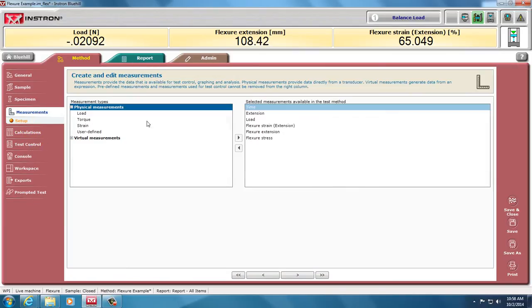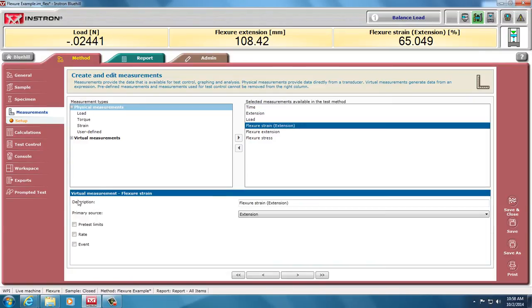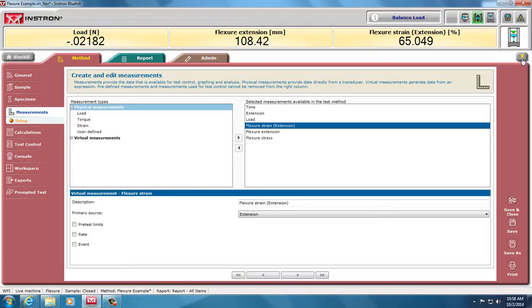When we go under measurements, we have physical measurements, such as time, extension, load, and then we have virtual measurements. As we click on here, it tells you that it's a virtual measurement, flexural strain, flexural extension, flexural stress. If you hit the question mark up here, it'll take you to a description of what each of those are. Those are calculated quantities.